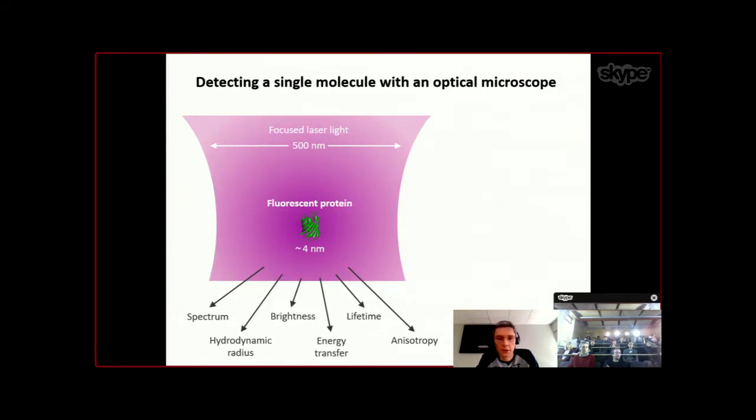And how did you get there? You got there because you have better lasers. You also got there because you have better probes: more photostable, higher quantum yield, higher extinction cross-section. You also got there because you have better detectors, okay? PMT, fast avalanche photodiodes, extremely low count rates, low after-pulsing probability. All this is helping you a lot.